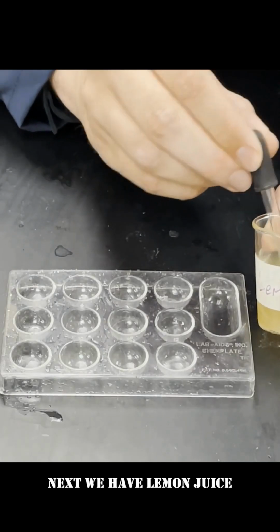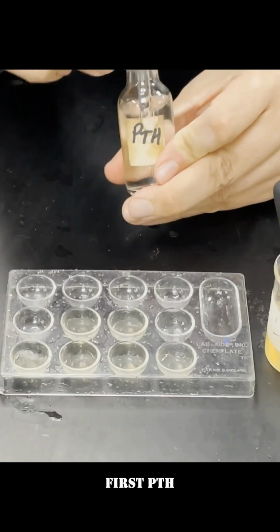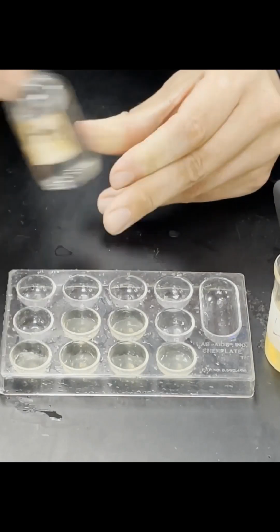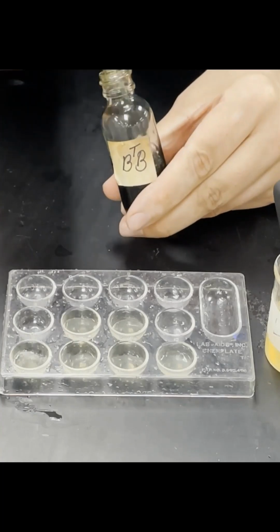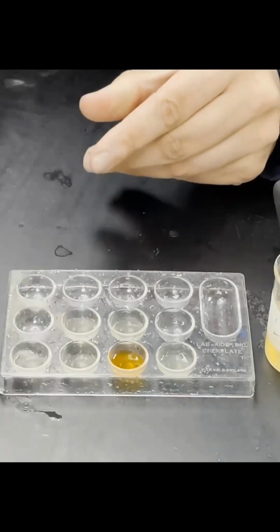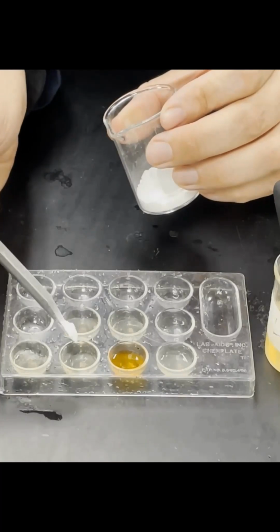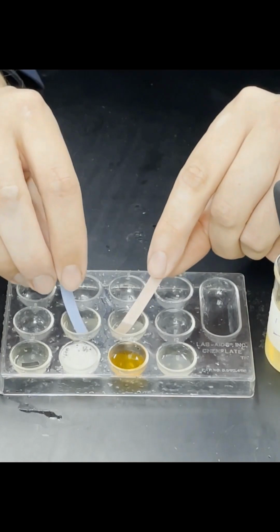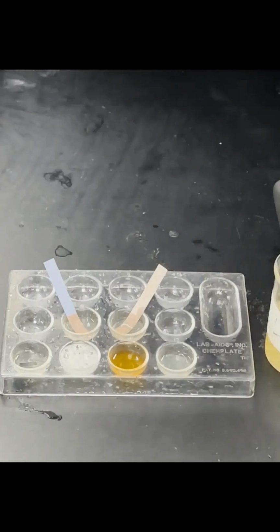Next we have lemon juice. First, phenolphthalein. Next, bromothymol blue. Carbonate. And litmus paper. So is lemon juice an acid or a base?